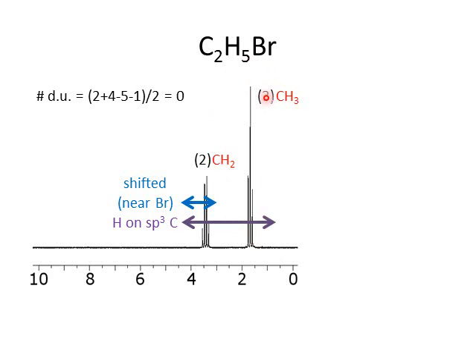Notice this signal tells me about a CH3. It's split into a triplet. A triplet, well, we get a 3-peak pattern, a short, tall, short triplet pattern, when we're adjacent to 2 neighboring nuclear magnetic moments, which means when you're next door to a CH2, or 2 identical CHs. But in this case, notice we've got a CH2 that seems to be next to a CH3, and we have a CH3 that seems to be next to a CH2. That's pretty straightforward how these things are going to fit together.